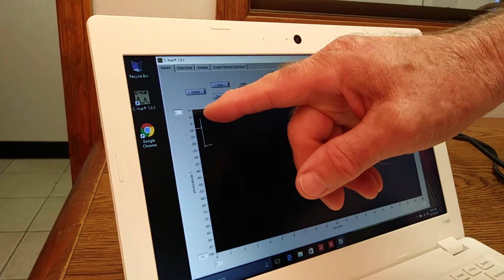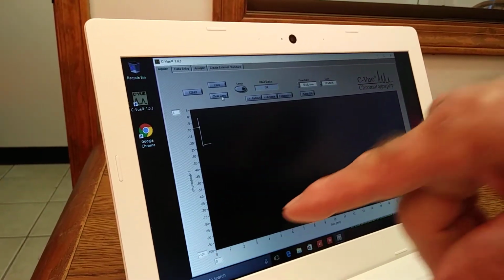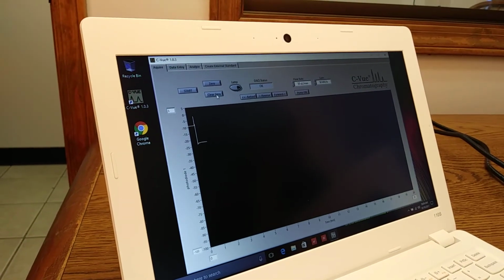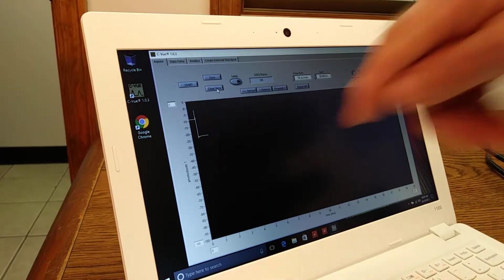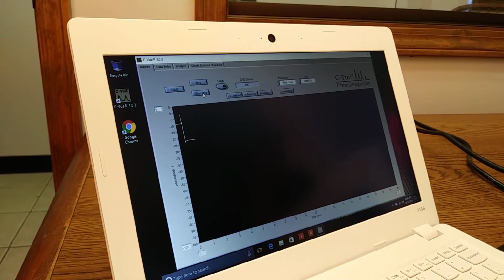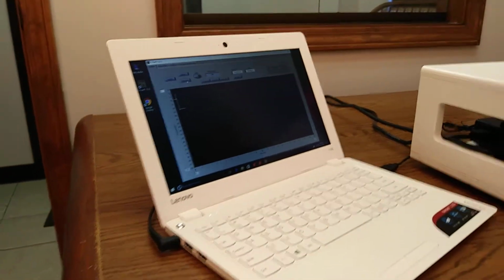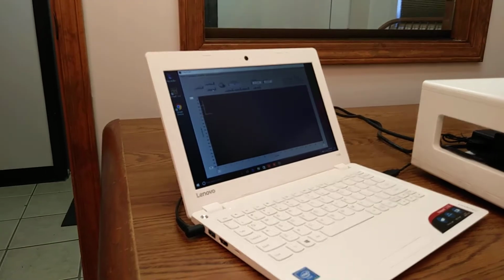0% light to the detector is up here at zero. Down at 100, minus 100, is indicative of full saturation. So we want as much light as we can get to the detector. More light gives better signal and consequently better signal to noise. So we're now at about minus 24 or so.